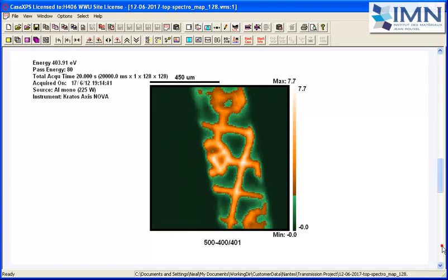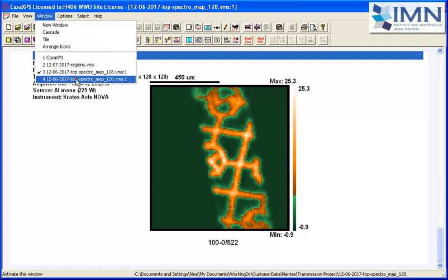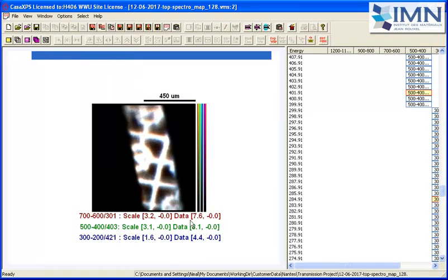And because these images are very much there and relatively stable here, although you can see a little bit of movement, if we look at an overlay of images taken from the different energies associated with the oxygen, the nitrogen and the carbon, when we overlay them, you can see that not only do these images register reasonably well, the size of the image is stable, and more importantly, the intensity across the slot that is acquiring the data in this deflection mode is also stable. So we would expect to see a very stable transmission as a consequence.